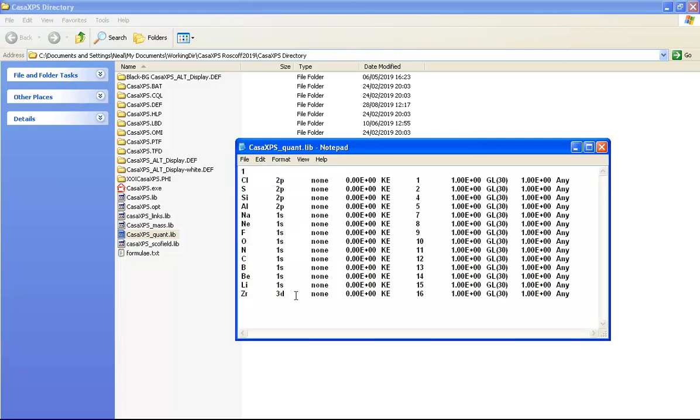When I save this file and then restart CASA XPS so that both the element library and this configuration file are read, then subsequently any time I use the create regions button, the zirconium 3d will be used to quantify rather than the zirconium 3p.